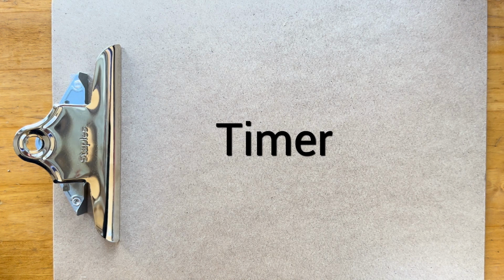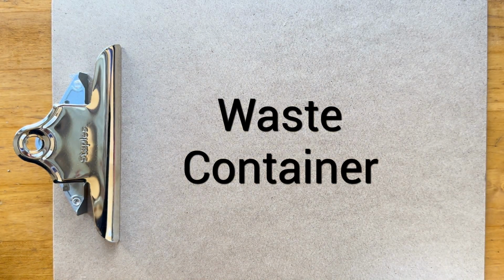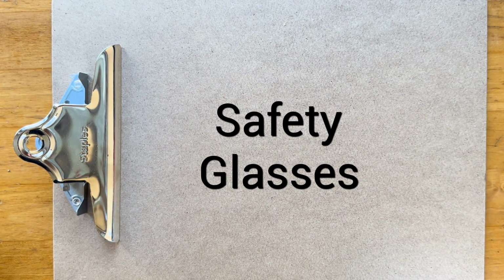And I like to have a small liquid waste container, so that once I've done a test, I'm not actually taking that material and dumping it into like the stream or pond or whatever, which isn't good. If you feel more comfortable, you can have your young people have safety glasses.